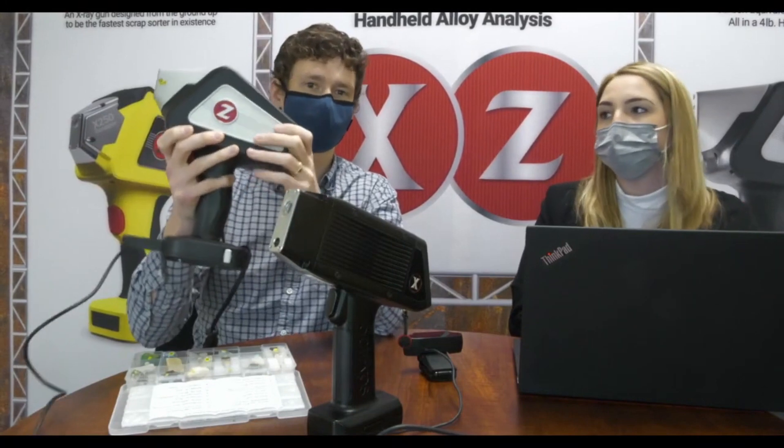So you can see lithium, carbon, hydrogen, sodium — all that cool stuff along with the heavy metals as well. The LIBS can do it all.